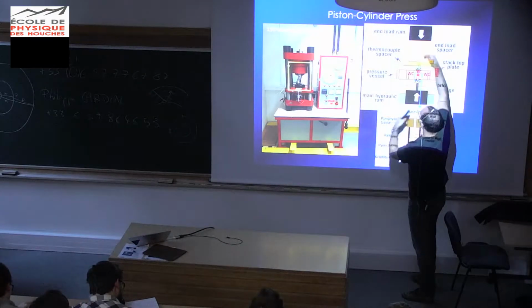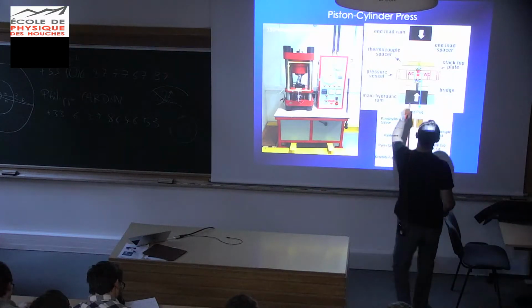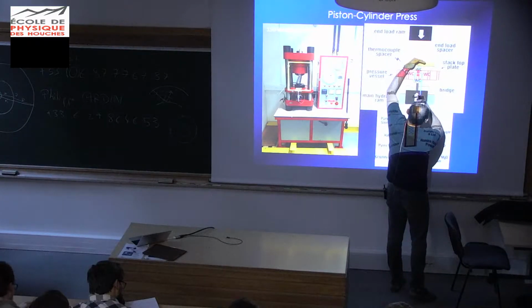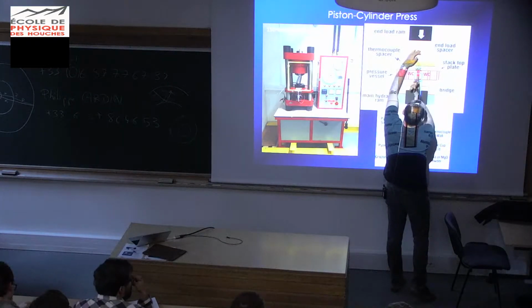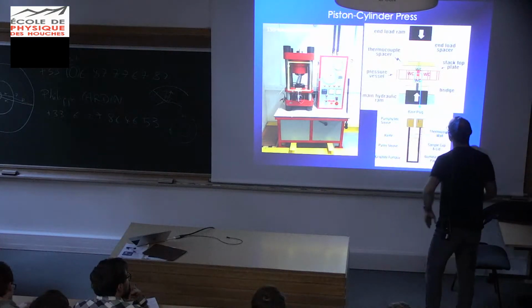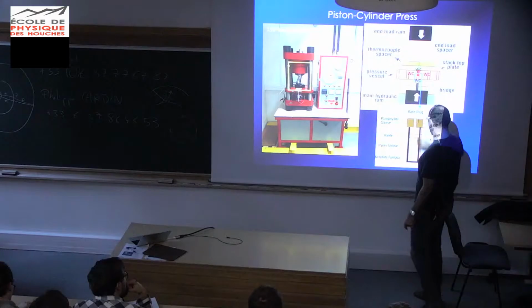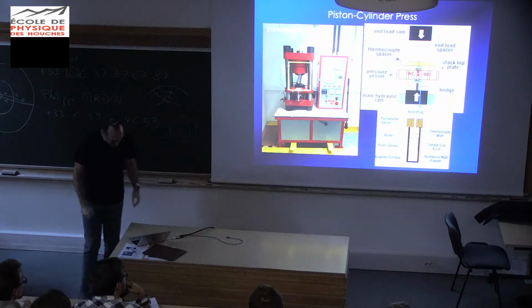The 150 tons are on this main ram. You never put 150 tons here. You would just blow everything up. And your sample is this little red thing sitting here. Okay? So first you compress everything to put it at high charge so that it doesn't blow up, and then you send that ram up with a pressure of usually 10,000 psi, 15,000 psi. All right? So let's focus on this now. Your sample assembly, everything you're interested in sits here, and we're going to see a detail of this on the next slide.